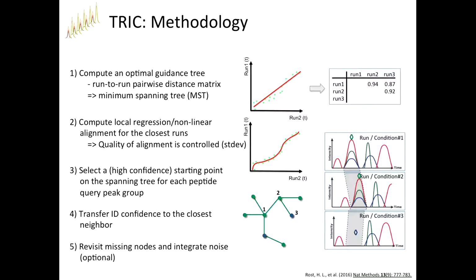This needs to be taken a little bit carefully, because this is assuming that your peptide is below the limit of detection and that there's nothing else in this region. However, if you have a bad interference in this region, you're integrating noise unselectively, so you might get super high values. So this step is really something that you need to be quite careful about, and I would suggest to manually inspect this again if you want to use requantification.